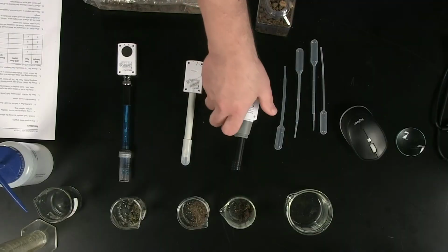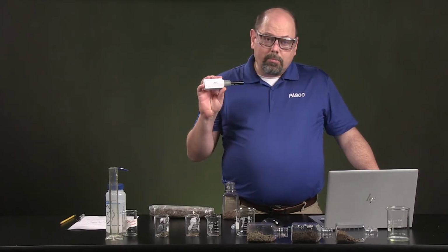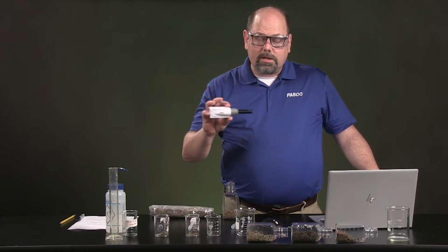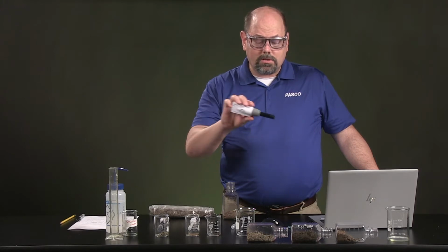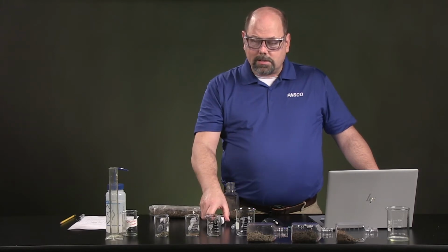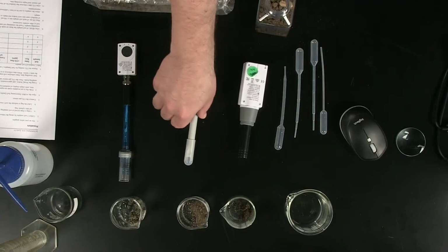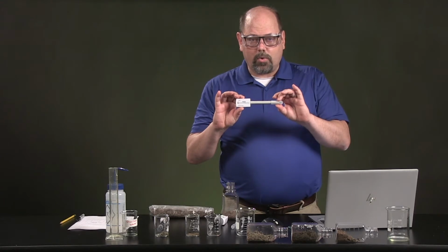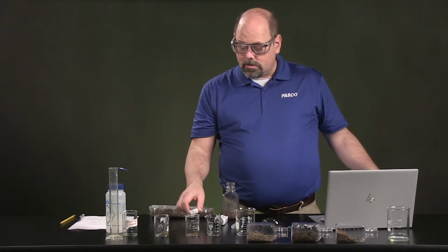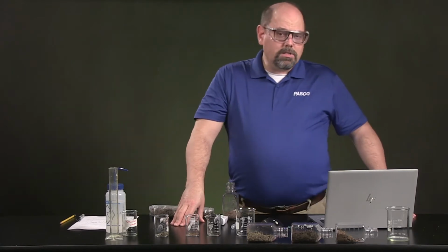The next piece that we're going to determine is the biological activity. Everything that's living is going to be breathing and consuming materials in there, just like we do in respiration. So we're going to put the CO2 sensor onto each of those soils that we tested to see if we can determine sort of how active that soil is. The next, we can tell what's dissolved in the soils when we add some water to those with the conductivity sensor. It's a general measure, and it should measure anything that's ionic that dissolves.